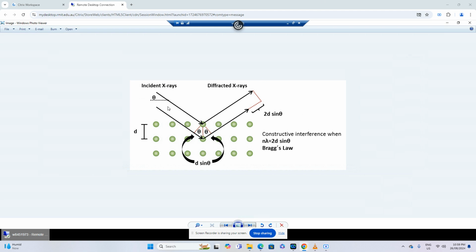As you can see in this picture, the incident X-rays produced by the source illuminate the sample, and whether it is a powder sample or a fully dense solid sample, we have a unique arrangement of atoms in that sample, and there's unique spacing between these atoms, which is known as d-spacing. Now the XRD machine is capable of measuring the d-spacing between these atoms.